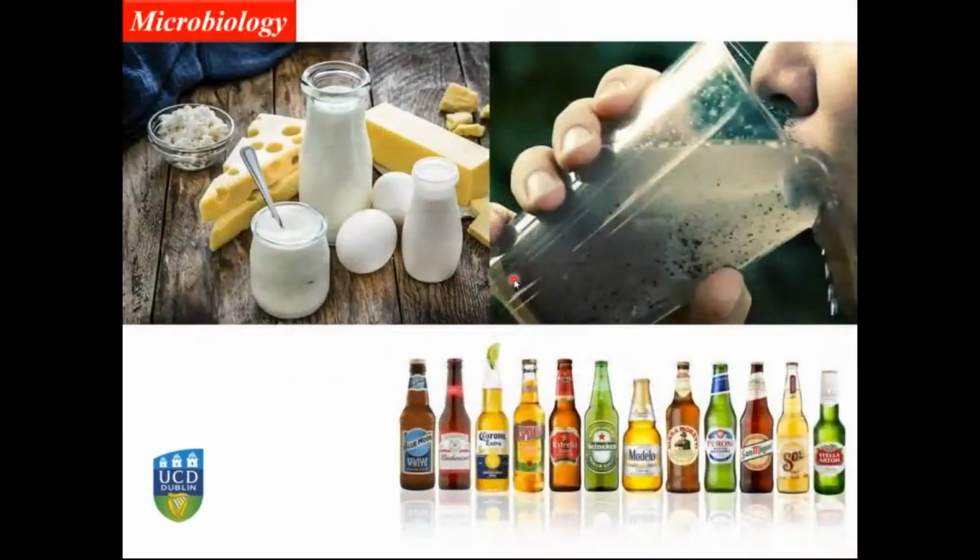Microbiology, let's go smaller now. So microbiology is an area where, when we think of the number of applications that we can do by flow cytometry, it is massive, but it's quite interesting because there are not many users in our facility in the microbiology area. So I hope this is starting to convince more people who are working in microbiology to use flow cytometry and cell sorting.